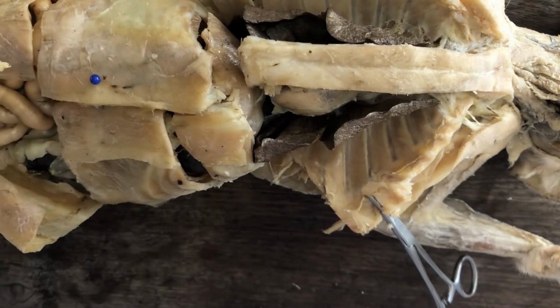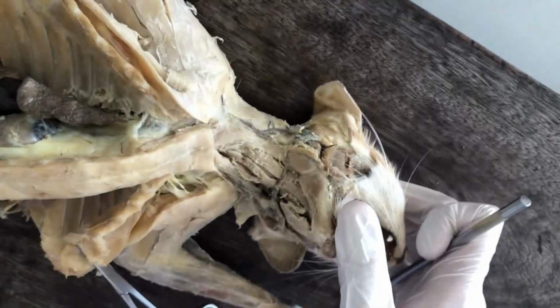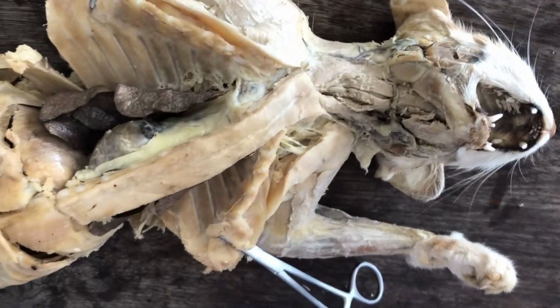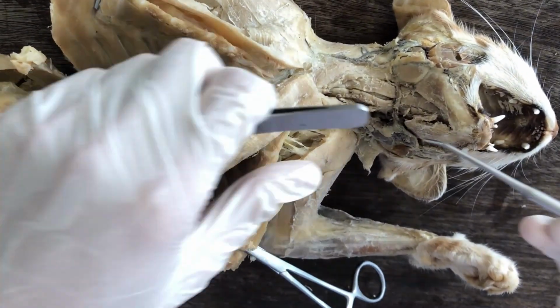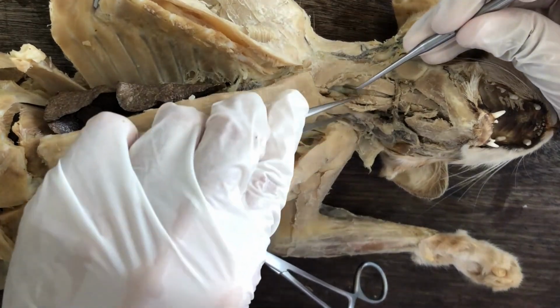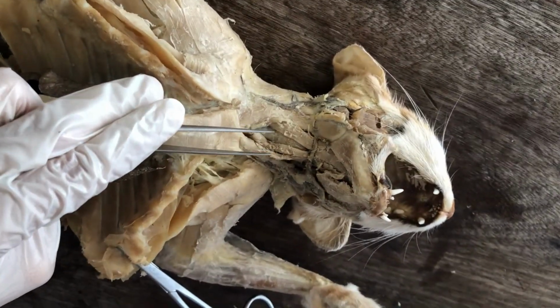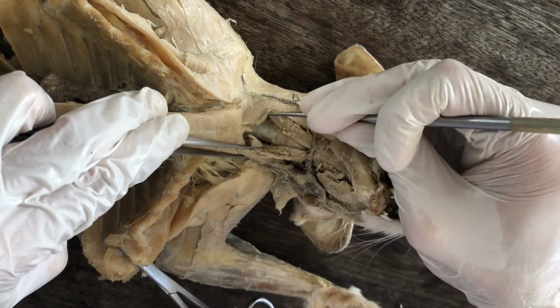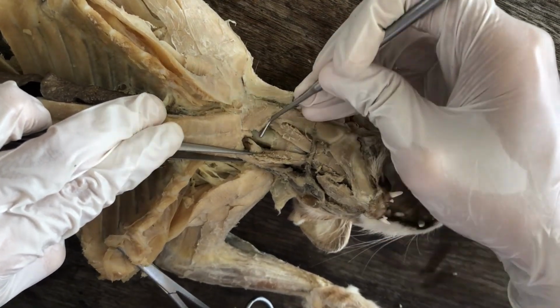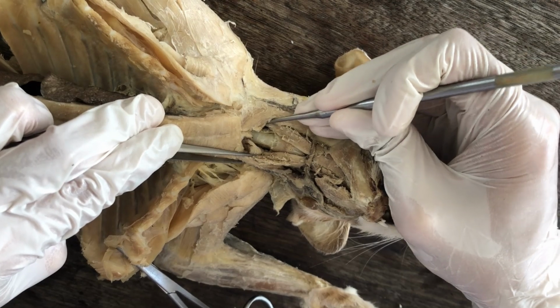Okay, and then after the lungs, remember when we dissected the throat, the respiratory tract in the throat. That's the trachea, the windpipe, right?